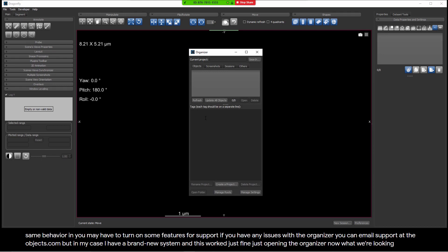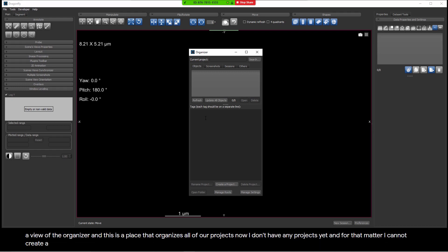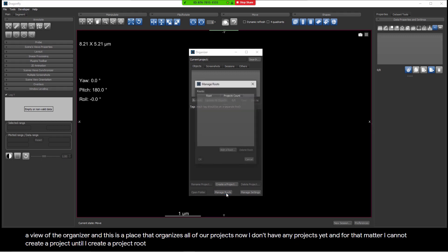What we're looking at here is a view of the organizer, and this is a place that organizes all of our projects. Now, I don't have any projects yet, and for that matter, I cannot create a project until I create a project root. So there is a spot for Manage Roots, so we will start there.